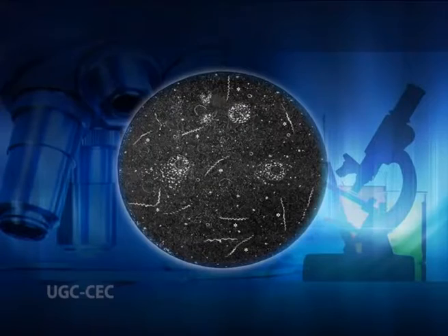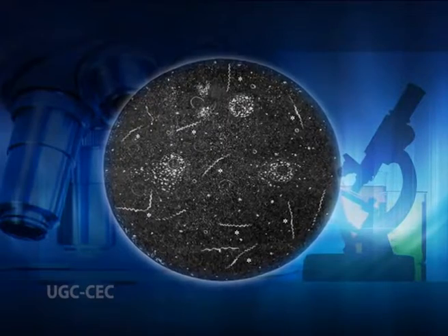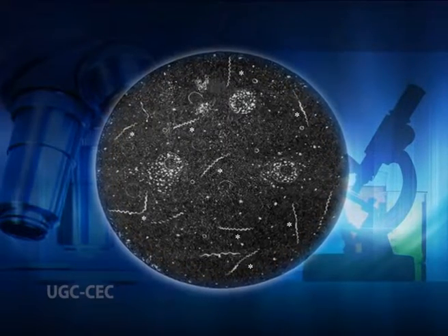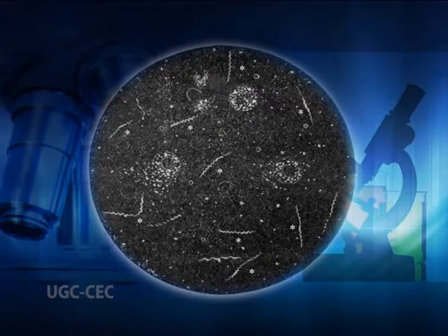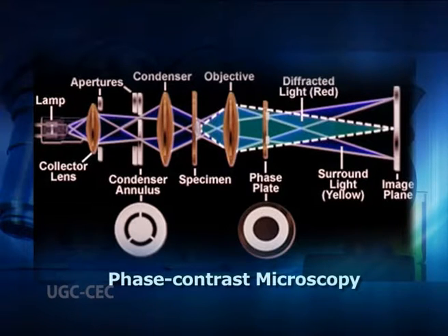A spatial condenser is used, which causes light to transmit to the specimen at an angle not oriented towards the microscopic path. It is used for observing bacteria such as Treponema, which causes syphilis, and Leptospira, which causes leptospirosis, and other semi-opaque to translucent specimens. Phase contrast microscopy. Phase contrast microscopy allows the examination of live unstained organisms.